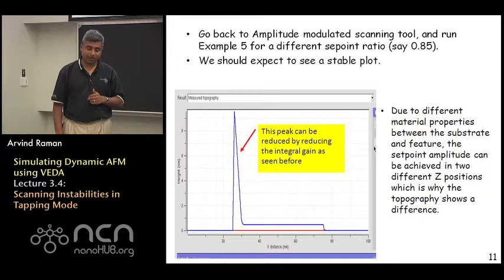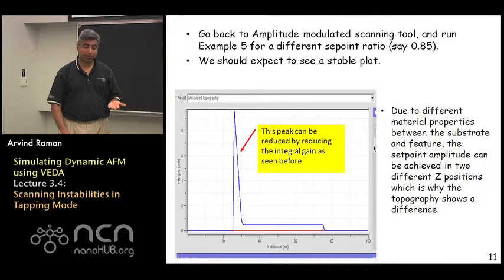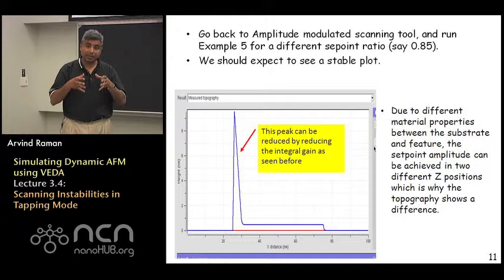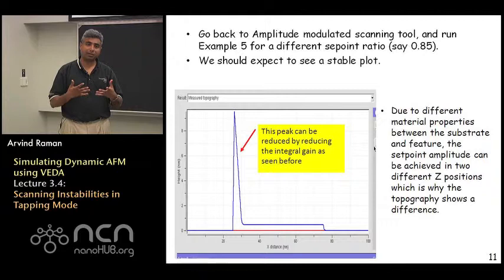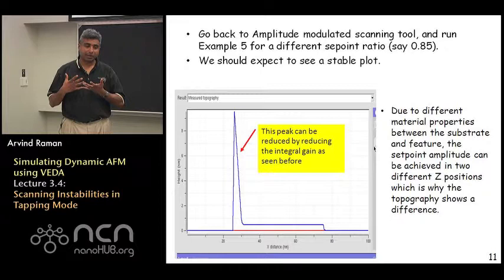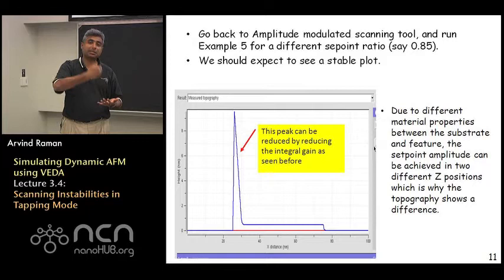So when this is repeated at a set point of 85 percent, 0.85, we see that the instability is gone and indeed you are able to scan the surface without the z piezo trying to go up and down to try and find this forbidden amplitude over the feature. We do find there is a large transient as you get on the feature which is due to an overshoot that occurs due to large integral gains. So you can try to play around with the integral gain to try and reduce it. But what you have eliminated entirely is this jagged up and down completely unstable motion of the controller that would lead to constant stripes in your image as you image on a real AFM system.